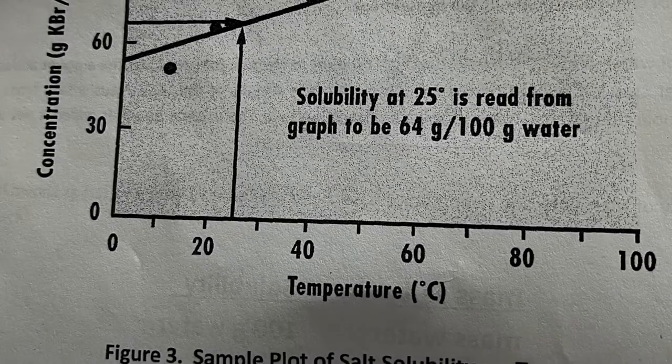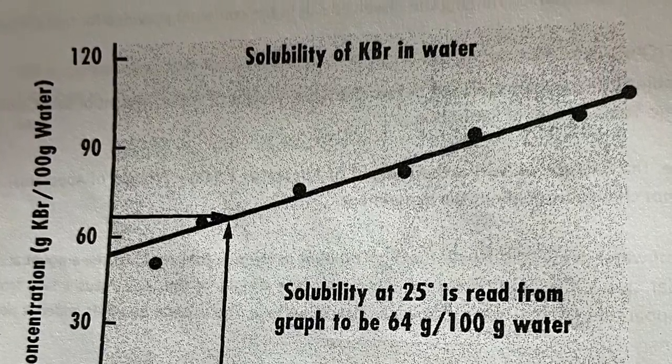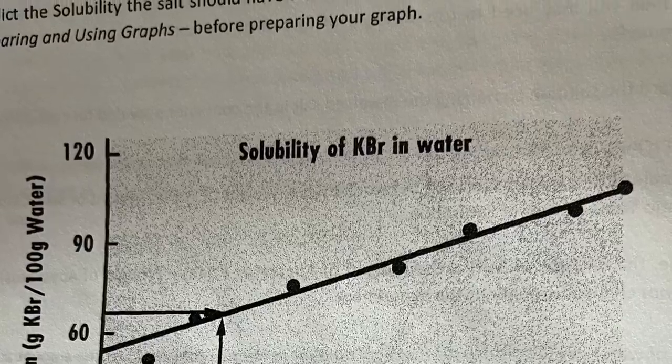Discard in the proper waste container. Complete the calculations in your lab notebook. You should expect a curved line on your graph instead of the straight one that's shown here.